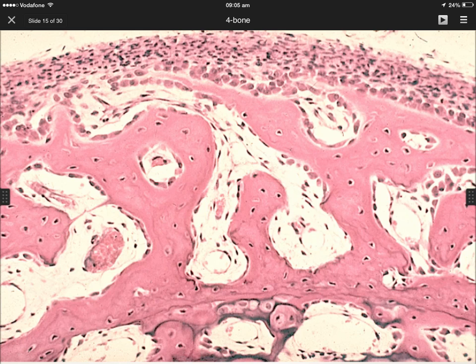Nice picture for the spongy bone. Here you can see the irregular bony trabeculae, which are acidophilic in staining. And in the picture you can also see these irregular bone marrow cavities. So you will describe or diagnose structures in the bony trabeculae and in the bone marrow.